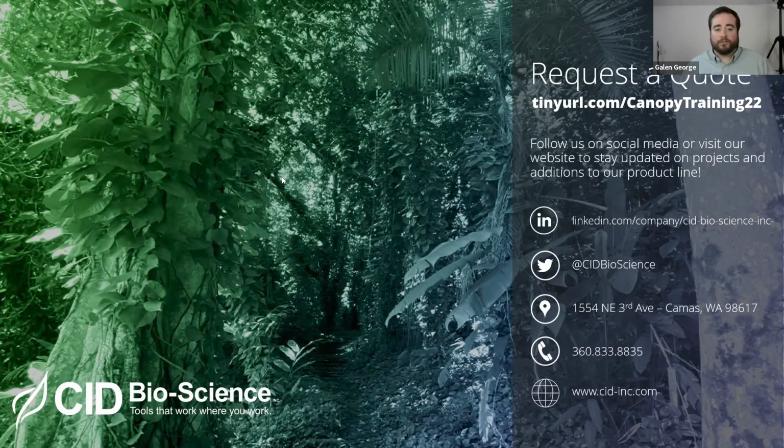And so that's for the next question, I was asking about when do we use these. In direct sunlight conditions, you can use these neutral density filters to help alleviate that problem. So those are two possible workarounds for direct sunlight.